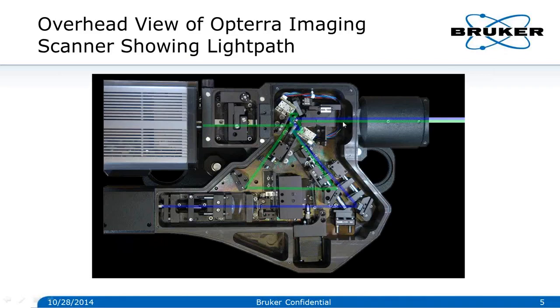On the return path, the light passes again, bounces off a couple of reflectors back through the emission pinholes, and then is reflected off the backside of the galvanometer and off another piezo that reflects the return emission to the camera and paints the image on the camera chip.